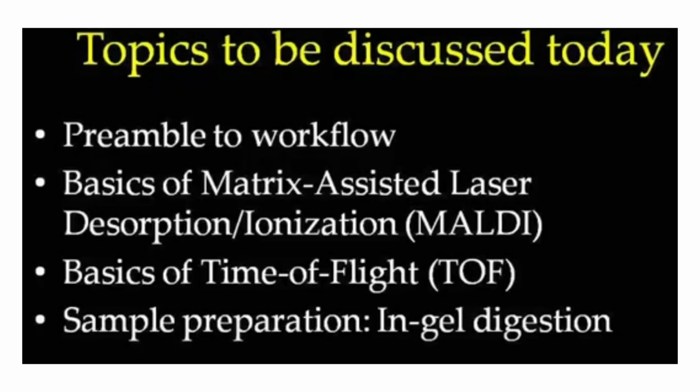Now we want to identify the proteins. Although they have done this, how exactly is mass spec performed? In terms of mass spec, there are different ionization techniques available. We'll be dealing with the matrix assisted laser desorption ionization technique, which is MALDI. And after ionization, there are different ways of detecting the ions as well. We'll majorly be dealing with time of flight, which is a type of analyzer rather than a detector. It analyzes the ions, and depending upon that analysis, they hit the detector, and then we can analyze what type of protein it might be.